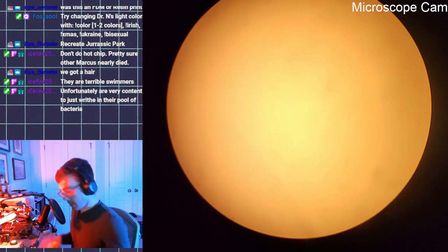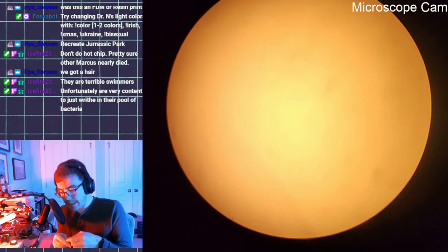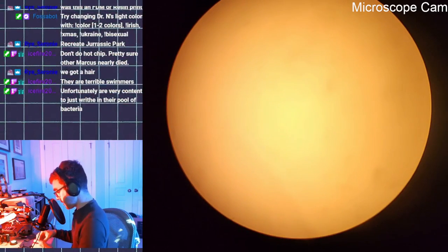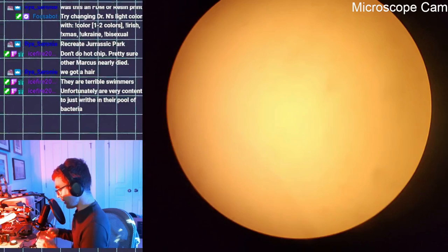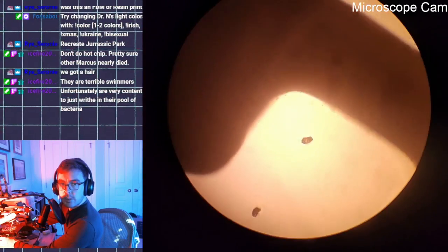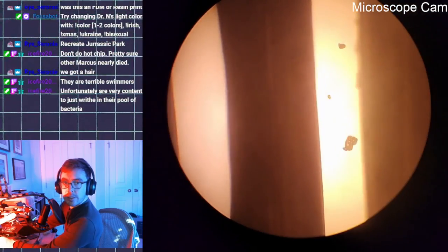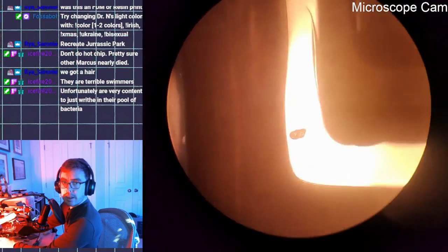I need my X-Acto knife. So I think what I can do is place this and squish it down onto this empty agar plate, maybe drop a couple C. elegans on that, and maybe they'll be able to swim around. Crawl around. Okay, give that a good little press down, more or less into the agar. It looks fairly similar, except that the bottom is now agar. Also, this maze is much more simple. It's just a bunch of loops. I think this will work much, much better.